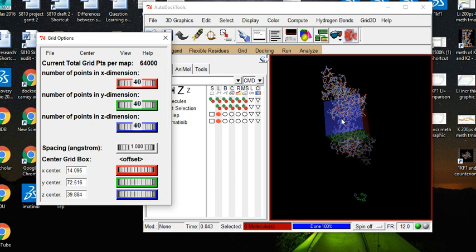It's also important to have as small a search space as possible, certainly less than 30 points. Probably go less really. Otherwise it takes forever to calculate. If you're doing a lot of molecules, you'd be there all day just doing 3 or 4 runs.